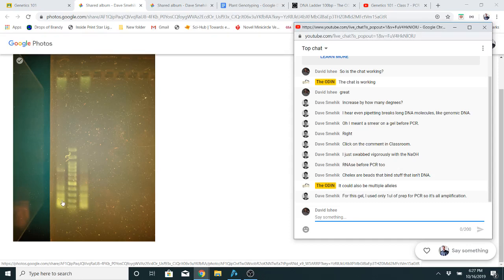And as these go away, these should get brighter. And so even if you're trending in the right direction, it should stop looking so even and almost smeary, but you can still see distinct-ish bands. They're just very close in size. Let's see. 1 microliter prep.